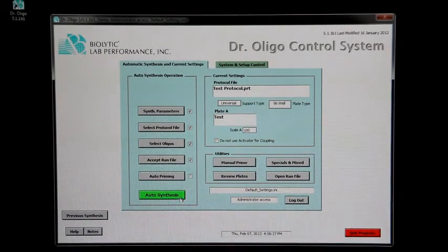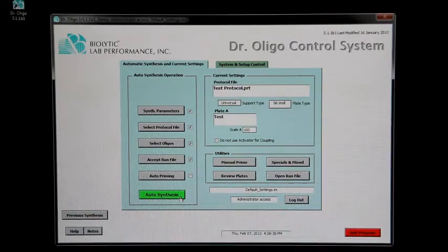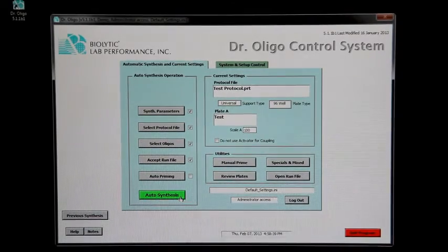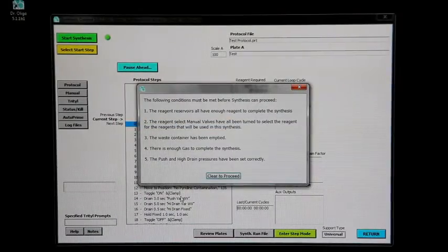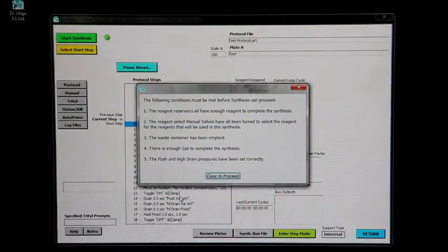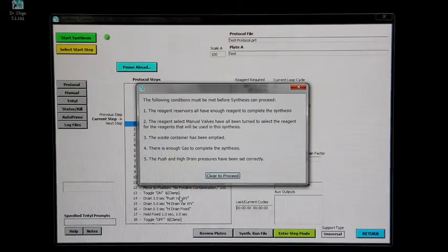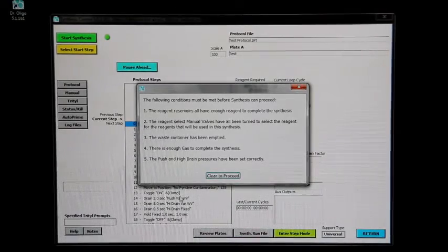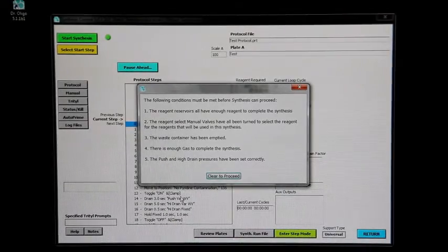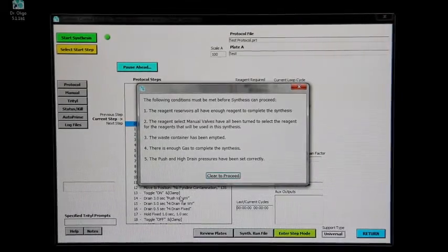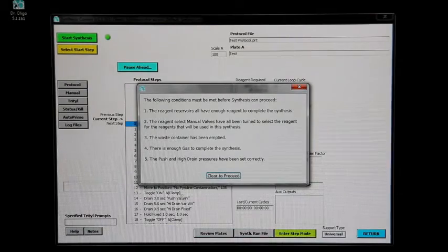When everything is ready, click autosynthesis. A checklist will appear, reminding you to make sure of the following things before starting the actual synthesis run.